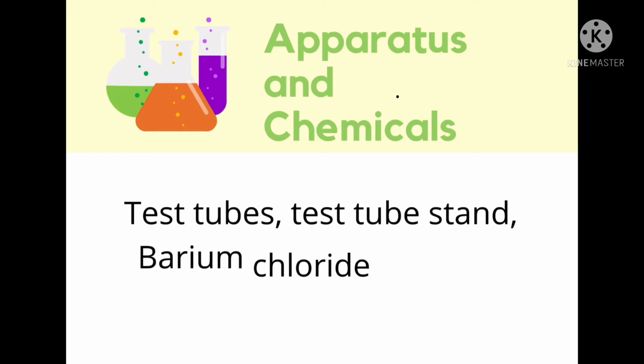For this experiment, we'll use a test tube stand, barium chloride and sodium sulphate solution.